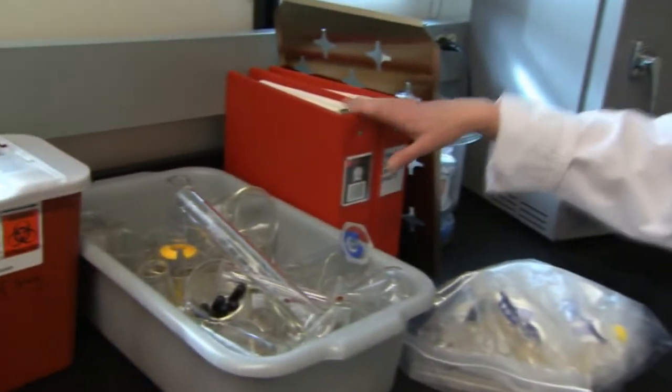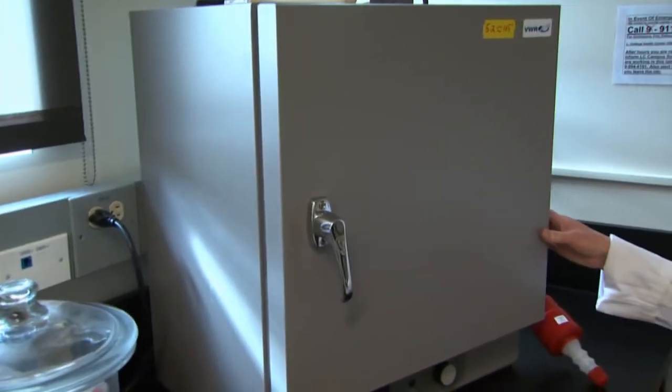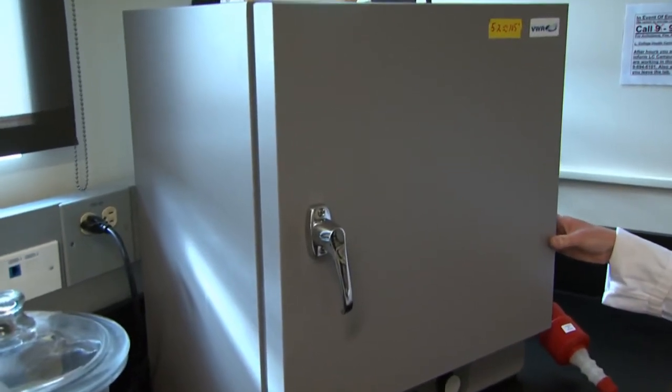MSDS sheets, an essential part of any chemistry lab so that students know and have reference to what it is they're working with. And finally over here, another oven that students can use for drying down samples or for preparing chemicals.